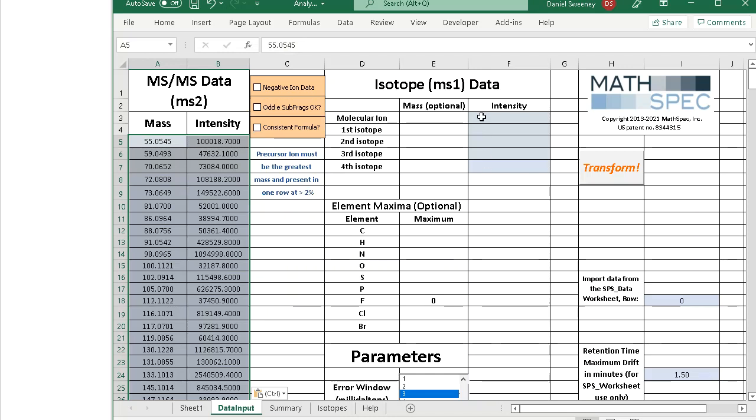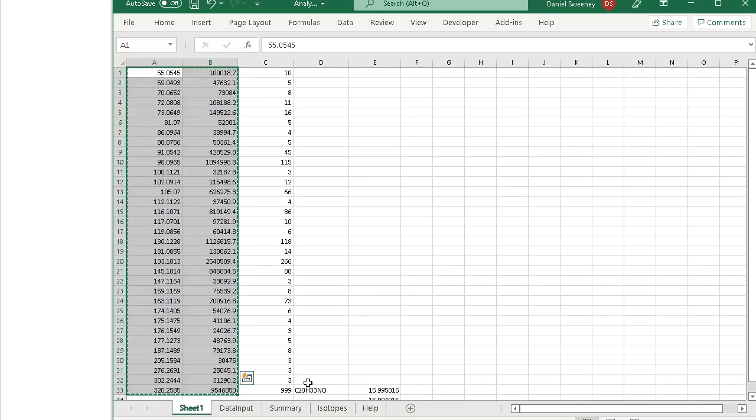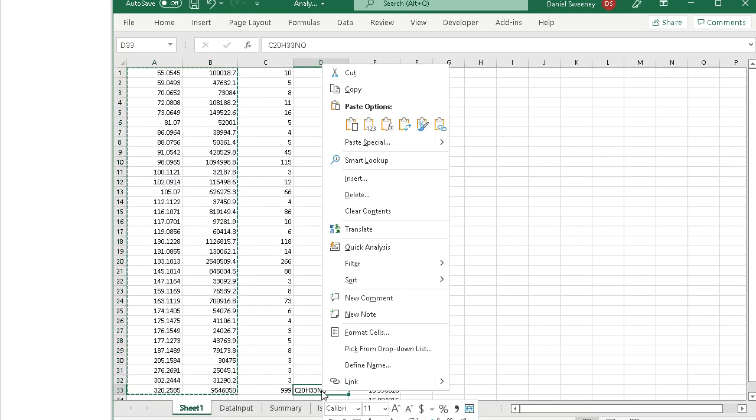There was no MS full scan data to get the isotope pattern of the precursor ion. I could use the formula for the fungicide, which should be pretty close probably.